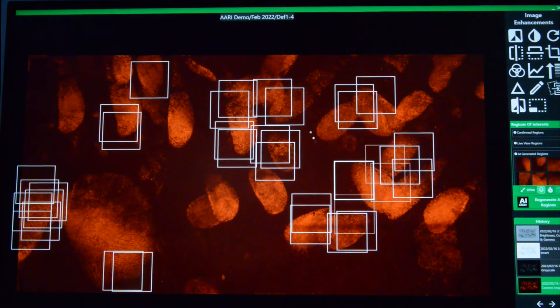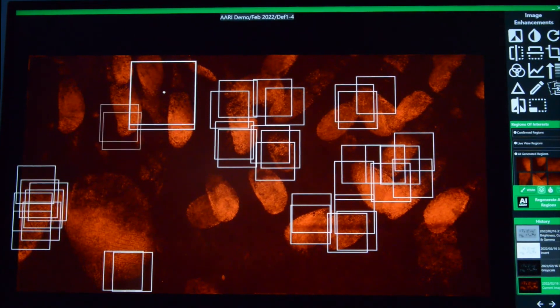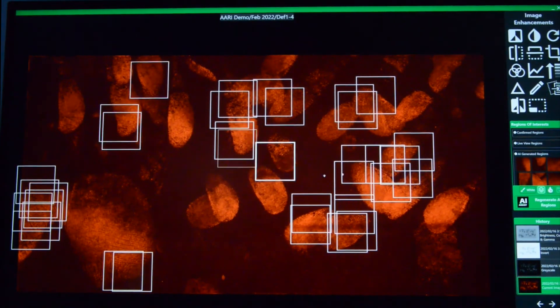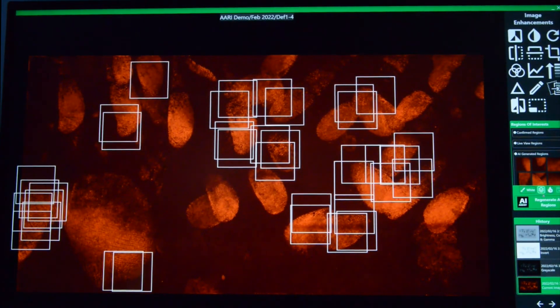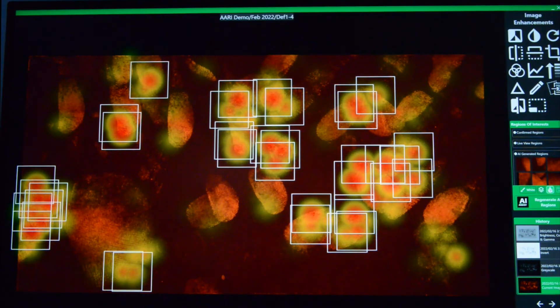So you can see it's picked out a number of different areas of interest and we can have this as boxes or we can actually have it as a heat map.